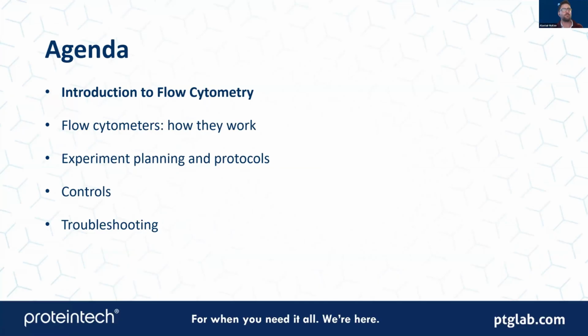Yes, flow cytometry really is one of my favorite immunoassay applications during my studies and also my time in industry. I used several immunoassays, and flow cytometry is one that stood out to me just because of the kind of data that you can generate and the various uses that you can put flow to.